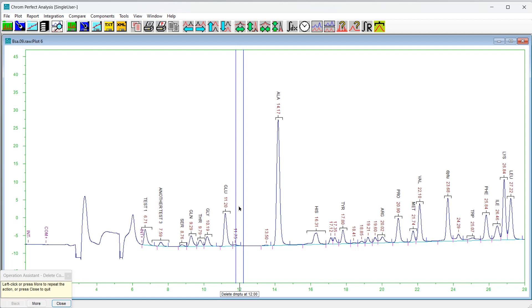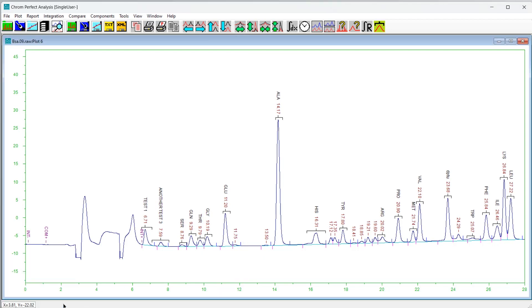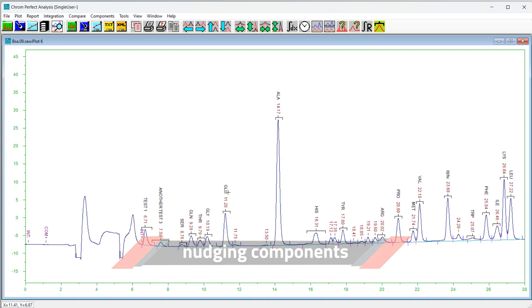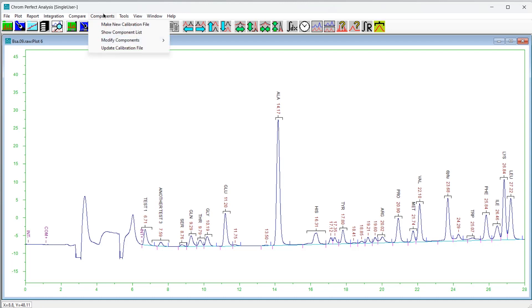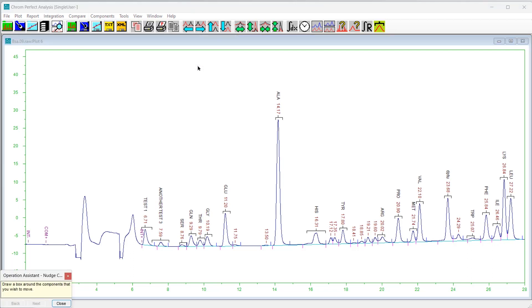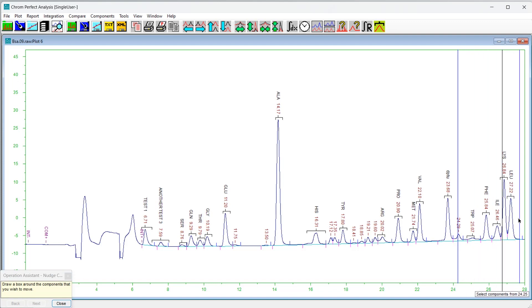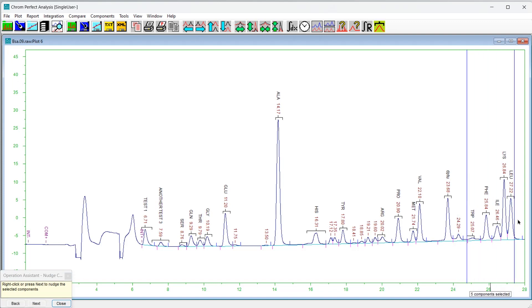Components that serve as the default component or as retention time references or internal standards for other components cannot be deleted. Nudging components: frequently it is necessary to adjust several components by a similar amount. To move multiple components graphically, choose Components, Modify Components, Nudge. The operation assistant form will appear, directing you to select a region of the chromatogram with the mouse. Click, drag, and release to define the region, which will be indicated by a pair of vertical lines. If there are no components, the label will so indicate.